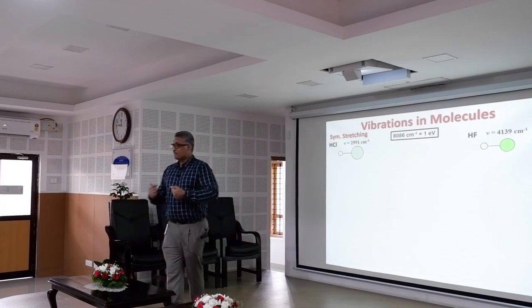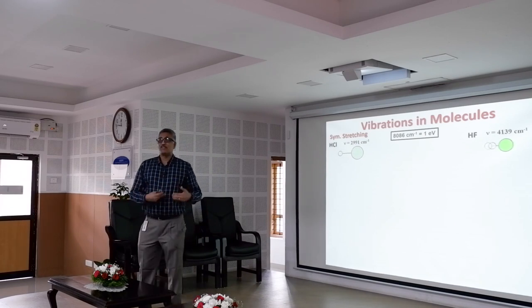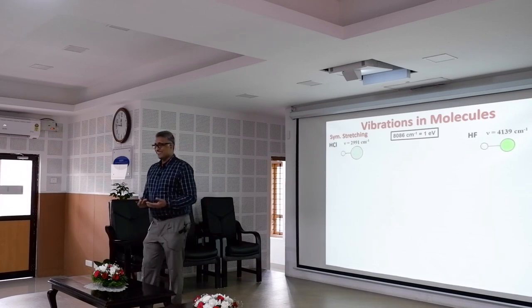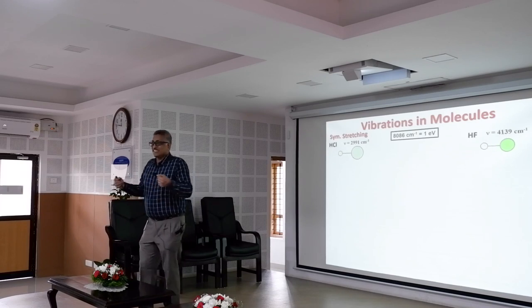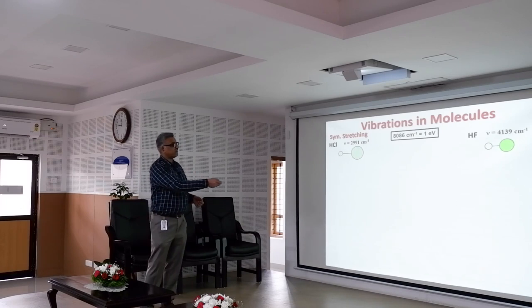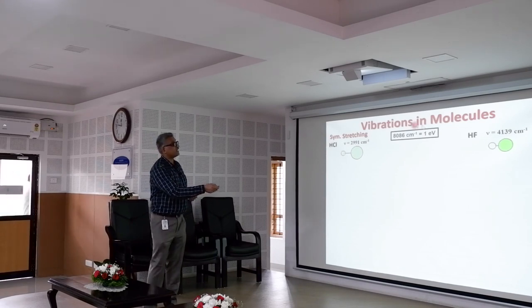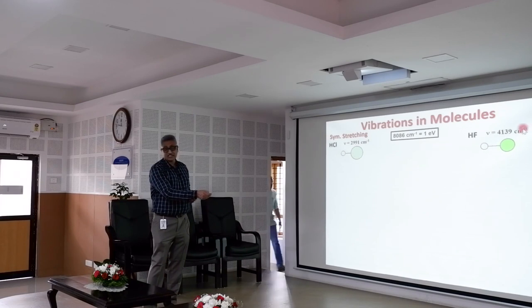So you will be vibrating vigorously. I always say, you always say, the kids are always energetic, right? So you have more energy when you have lighter atoms. You can see the vibration is faster here, and here the vibration is sluggish, right? And it is actually given by a particular energy term which is called centimeter inverse.